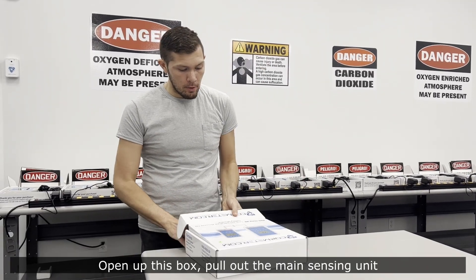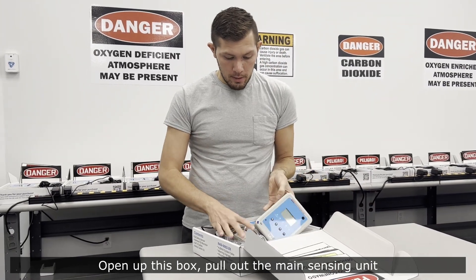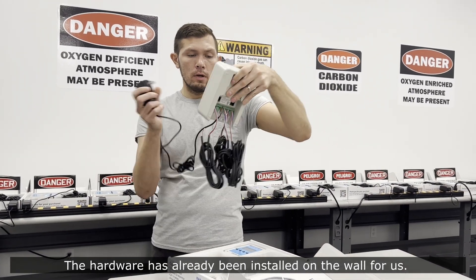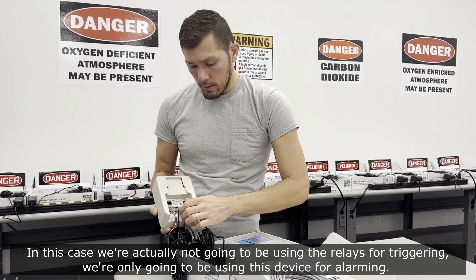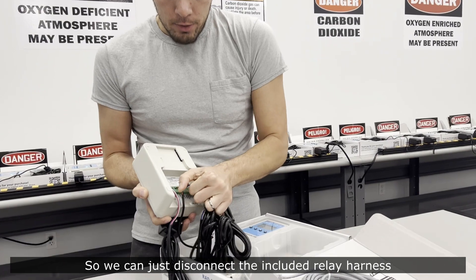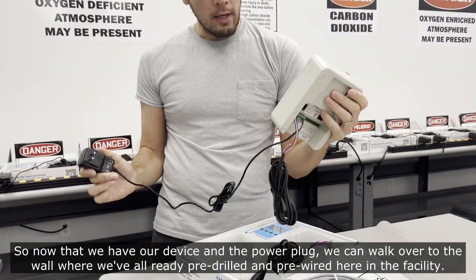All we'll need is the device and the mounting hardware. We open up the box and pull out the main sensing unit. The hardware has already been installed on the wall for us. In this case, we're not going to be using the relays for triggering — we're only using this device for alarming — so we can just disconnect the included relay harness.